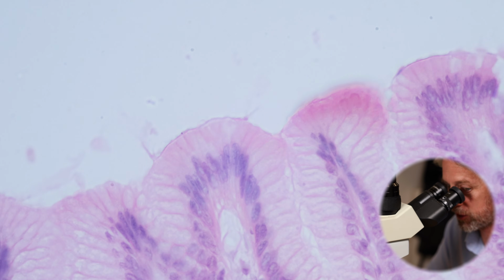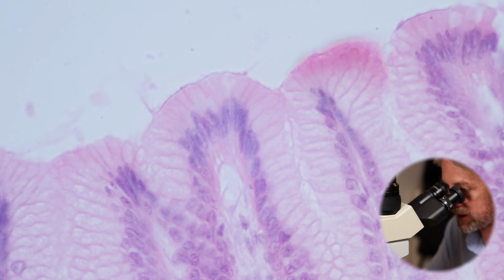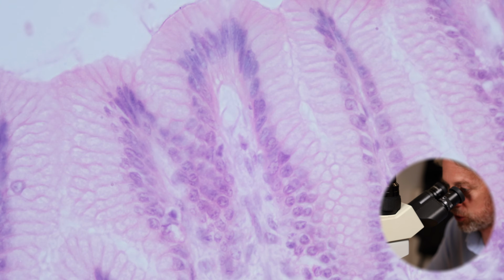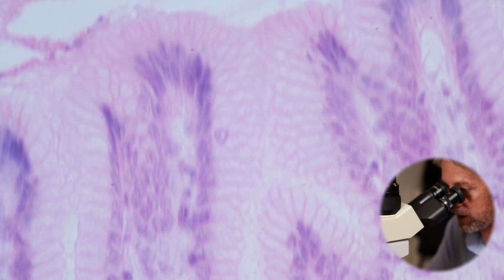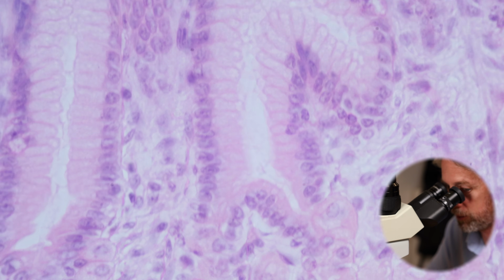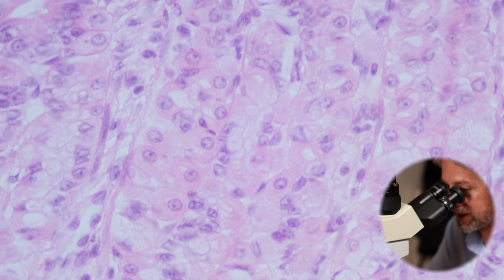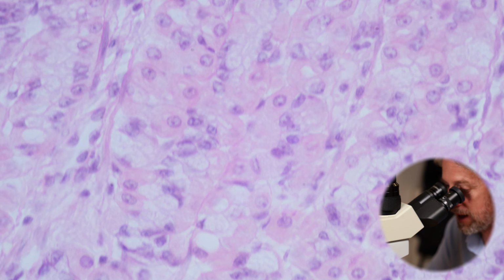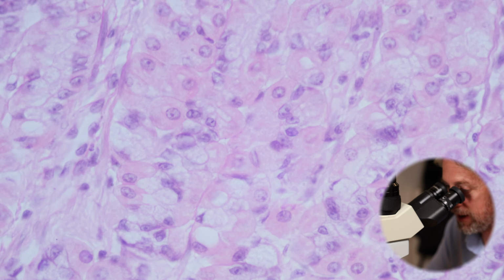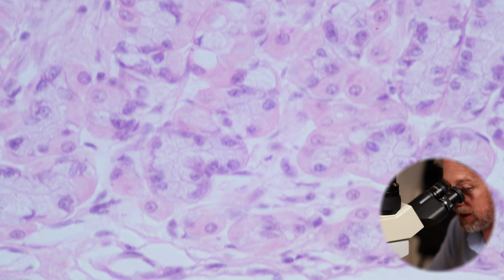So we've gone from the surface here, the lumen, we've got the epithelium, that simple columnar epithelium, those surface mucus cells, and we followed the gastric pits down. That is such a lovely shape, isn't it? Look at that. Oh, beautiful. The gastric pits down, we see that branching into the gastric glands, and down in the gastric glands we see the chief cells and the parietal cells. And then as we go down, actually this is the lamina propria here. So the lamina propria is the connective tissue supporting the epithelium.